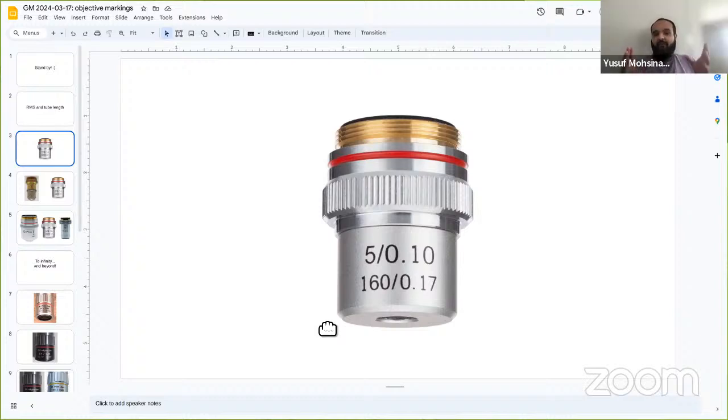That does, and for people who may not be familiar with microscopes and objectives, maybe we can anchor this discussion down to, is an objective similar to the lens on a DSLR camera? Yeah, I would say it's very much in the same spirit. There's a lot of concepts where they're really exactly the same. You'll hear, for example, F number, I think it's called in cameras, versus numerical aperture in microscopes.